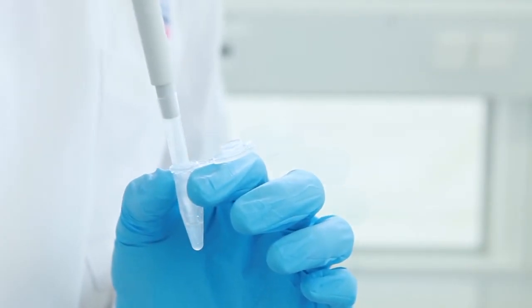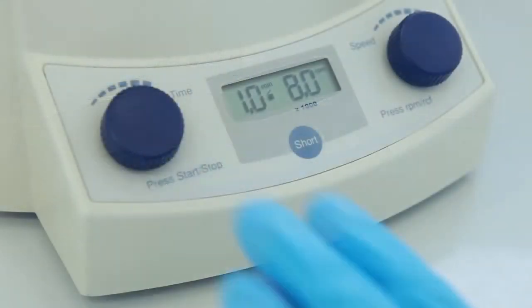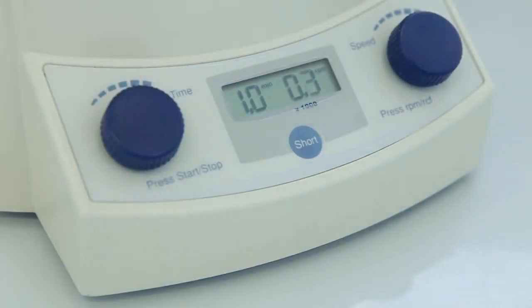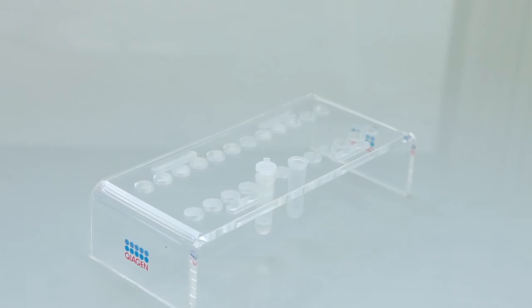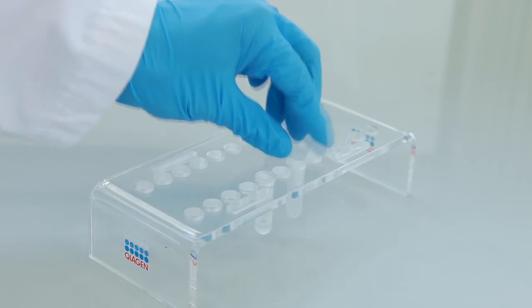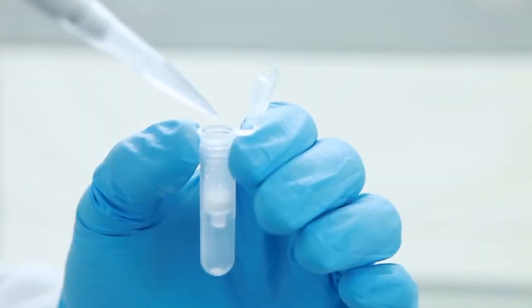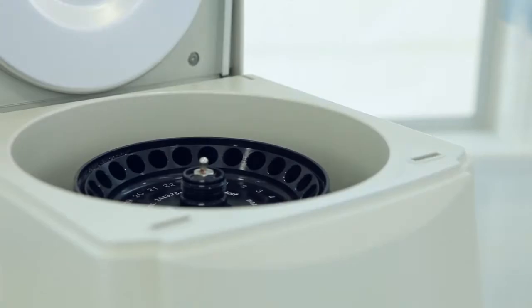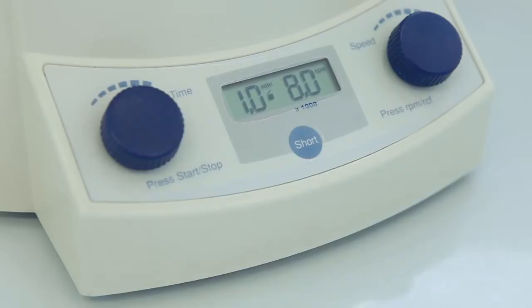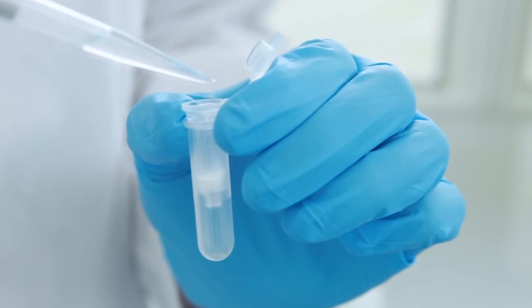Pipet the mixture into a DNeasy spin column. Add 500 microliters of buffer AW1. Discard the flow-through and collection tube. For the second wash step, use 500 microliters of buffer AW2.